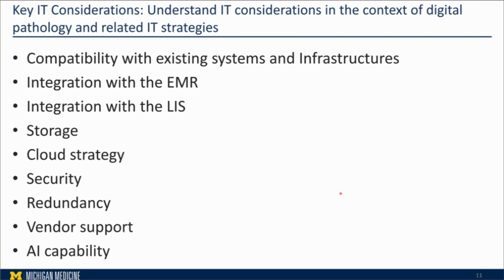What is the support from the vendors? Is it going to be 24/7, etc.? Maybe there are multiple tiers according to the financial support that the department can have. And of course, the AI capabilities that your IT team can leverage or integrate within this new platform.